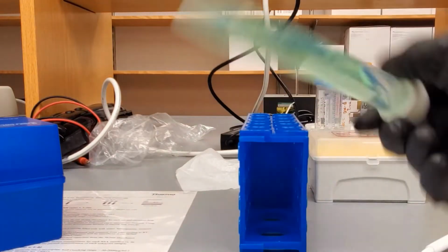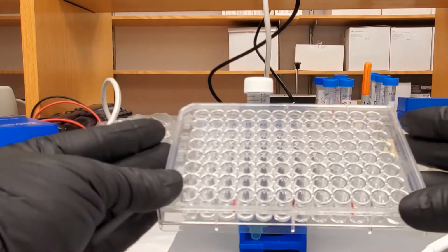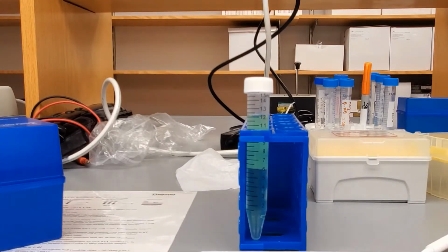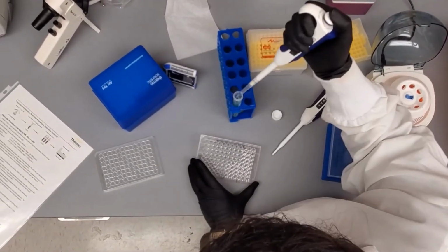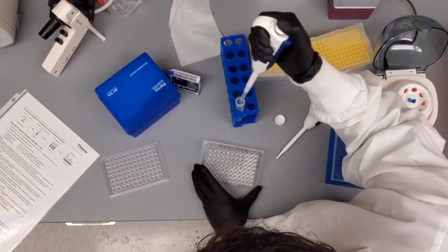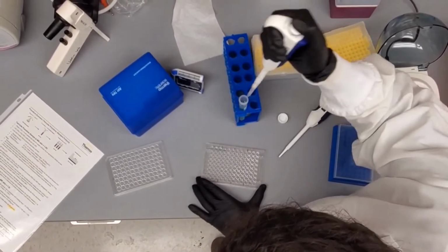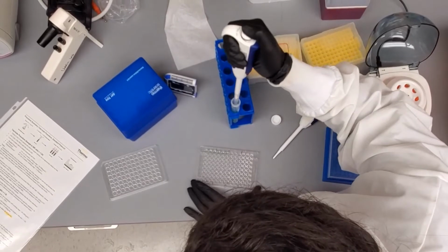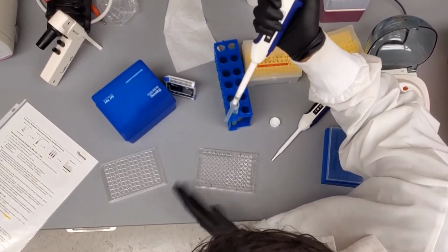So now that this is ready to go, I can go ahead and start loading my 200 microliters onto my 96 well plate, and I already added my samples onto the 96 well plate. So now I'm going to go ahead and start loading my 200 microliters of my reagents A and B mixture onto my 96 well plate, as you can see here. And make sure that there's no bubbles.